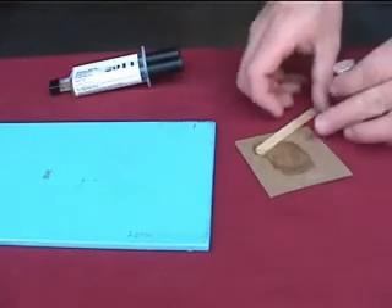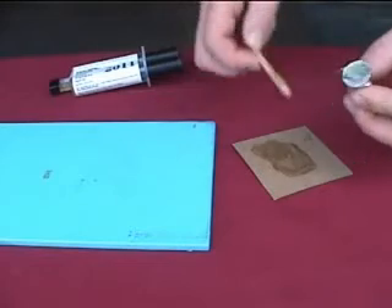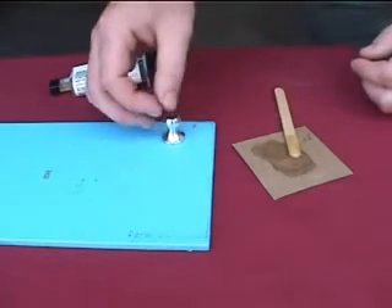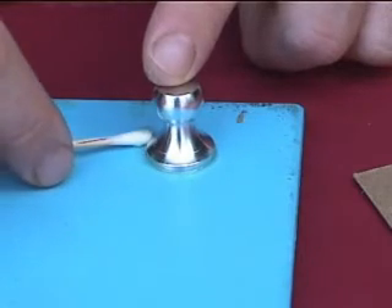A uniform coating of adhesive should be added to the surface of the dolly. When placing the dolly on the surface, it is important to push straight down to squeeze out excess adhesive. Twisting, rocking, or sliding of the dolly may generate undesired air bubbles. Excess epoxy should be wiped away from around the dolly without disturbing its position.